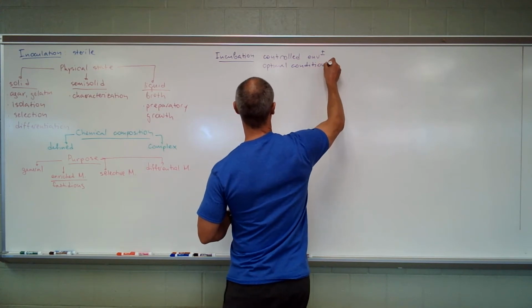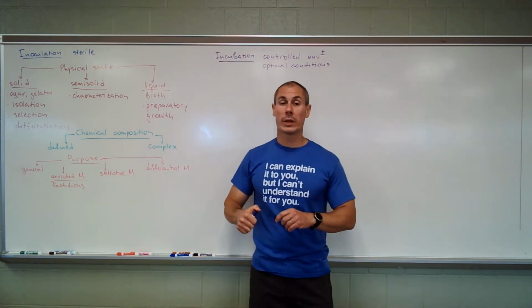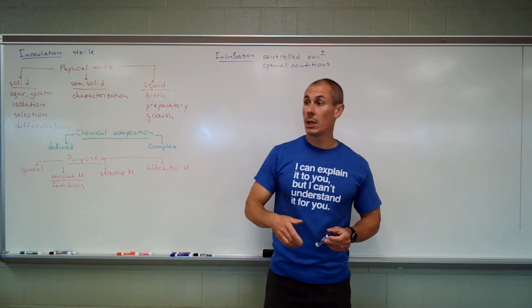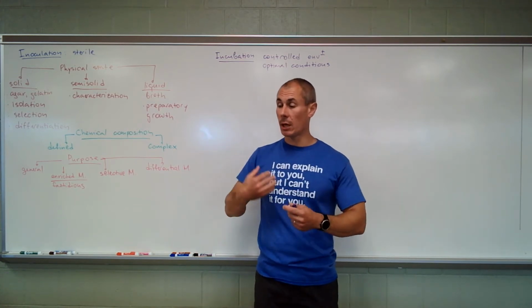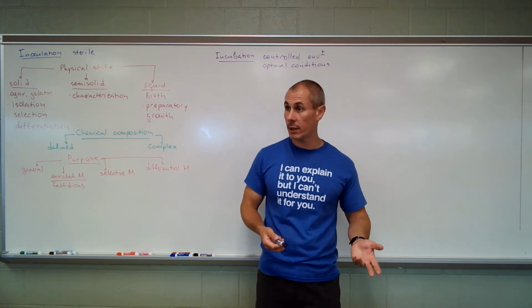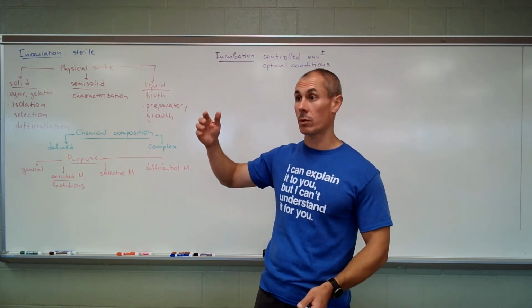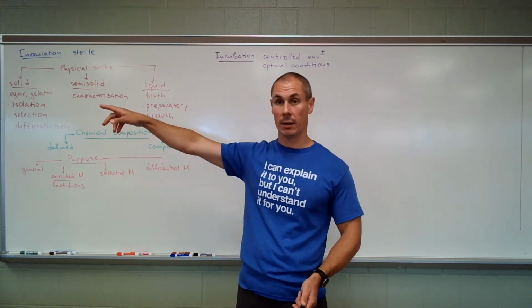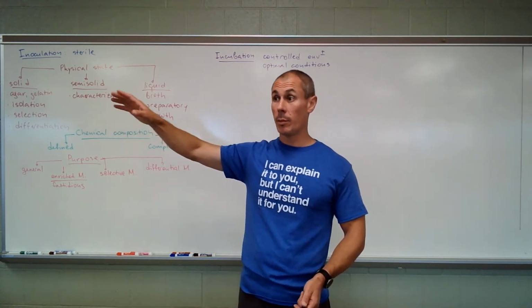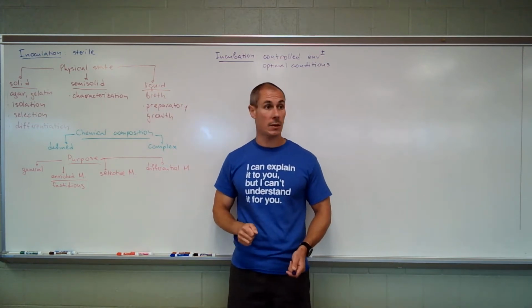the most important factor is that it's a controlled environment. So we can safely reproduce the results. Whether we are reproducing our own results, I want to repeat the same experiment 2 weeks later. Does that make sense? And I don't have to think, oh, what was the room temperature 2 weeks ago? Because it's not constant here. But I know 2 weeks ago I grew them at 37. Now I'm going to grow them at 37, right?